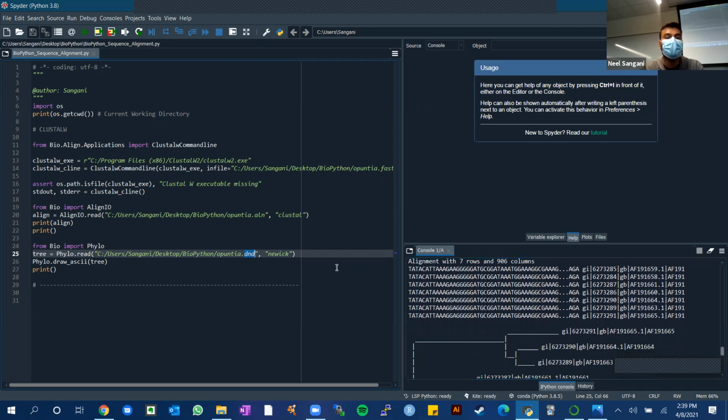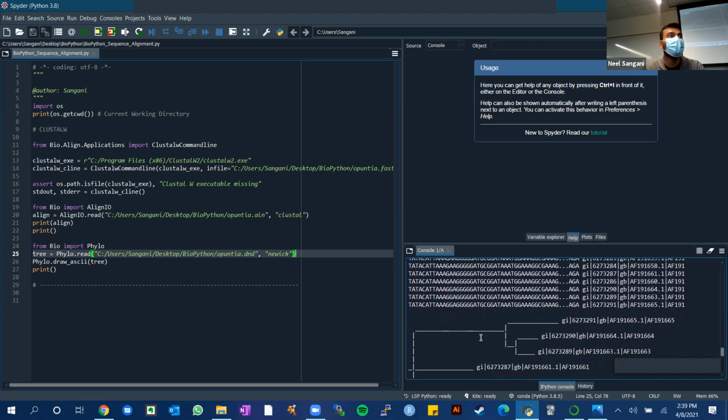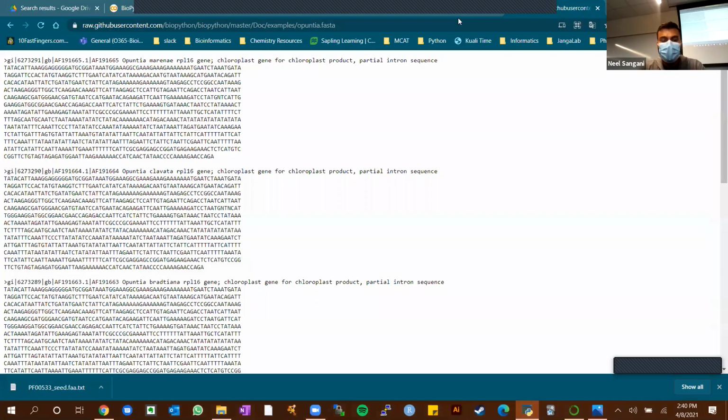There are more functions you can look into in the Biopython package to make it look fancier. If you want to look at humans and closely related organisms to humans, for that specific gene or protein you're interested in, you can do that. So that's a pretty fancy and handy way to quickly make your tree. That's just one example that I wanted to share with you guys.